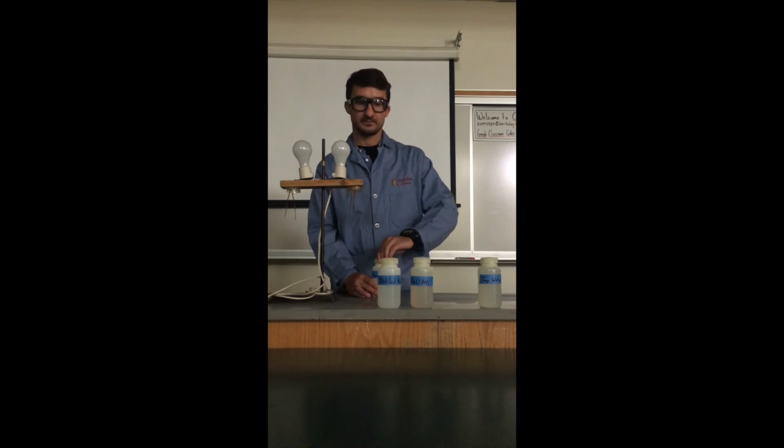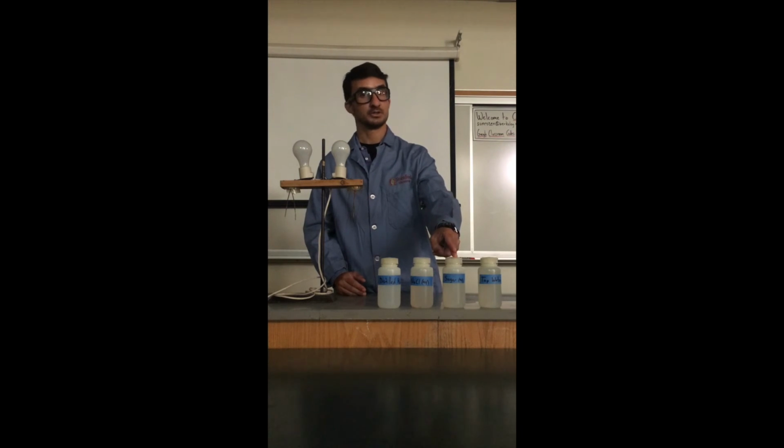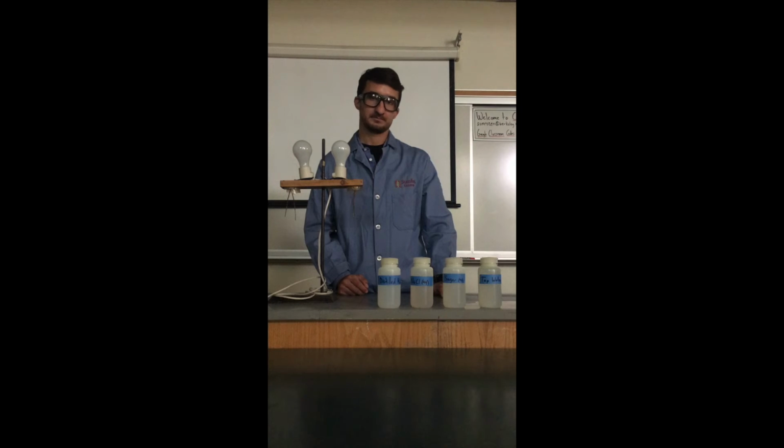So that's interesting, right? Pure water did not conduct. Water with some salt in it really conducted well. And then water with sugar in it did not conduct. So we need to think about what would be different between salt water and sugar water. How are those different? Why does that matter in terms of the conductivity of the solution?